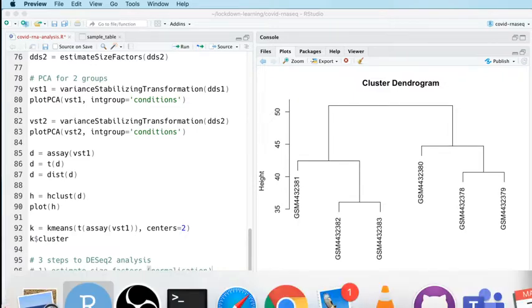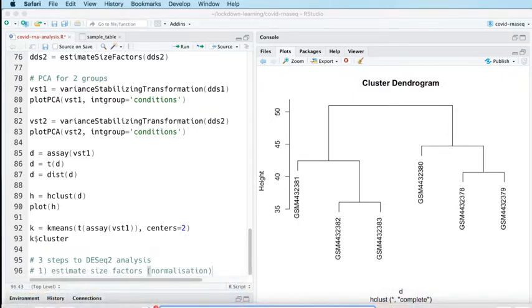I'm just looking for the appropriate thing to show you on my screen. When you do an RNA sequencing experiment, I'll do a bit of an overview here, just while I'm waiting for my whiteboard to load. We're familiar with this experience.